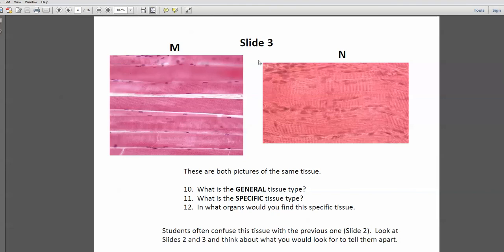So you look at this tissue type, and the first thing that should jump out at you is the striations, that up and down banding pattern. So you know immediately it's muscle tissue. Therefore, the specific tissue is either skeletal muscle or it's cardiac muscle. Skeletal muscle has very nice, long cells, and that is what we're seeing here, both in slide M as well as slide N. So this is skeletal muscle tissue.